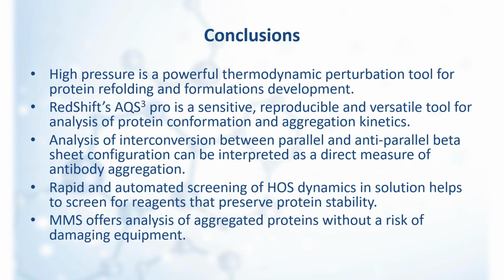I hope that I was able to give you a little hint today that high pressure in combination with the microfluidic modulation spectroscopy platform could serve as a powerful platform for protein refolding optimization and studies of protein stability in formulations development. I'm convinced that the AQS3 platform could be a very useful tool in our team's toolbox as we work with partially unfolded and aggregating proteins.